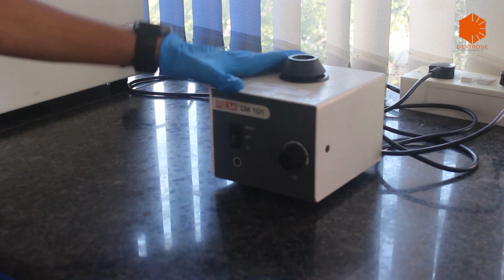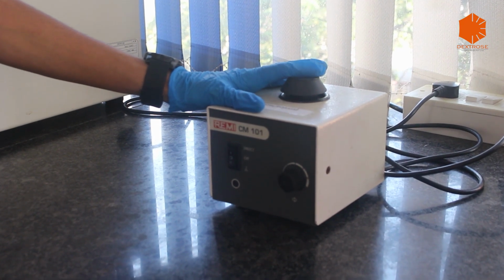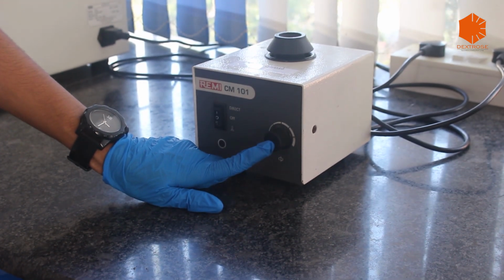So now we are going to see how a vortex mixer looks and how to operate it. So let's have a look. So this is how the vortex mixer looks. It consists of a rubber cup on which the sample has to be placed for proper mixing. It has a speed knob with which we can adjust the speed of the sample.